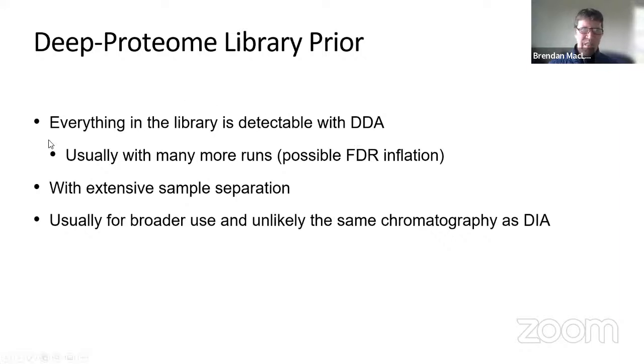So we haven't quite gone that far, which would be expanding our priors to even less certain that we're going to be able to see this stuff. But everything in the library is at least detectable by DDA, and usually with many more runs.